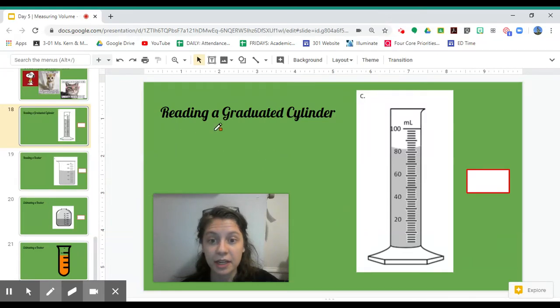Today, we're going to be talking about graduated cylinders and beakers. Here's our first example with a graduated cylinder. I know that this is a graduated cylinder because it's skinnier, and that is allowing us to have a more accurate measure of the volume of liquid that we're finding the volume of.